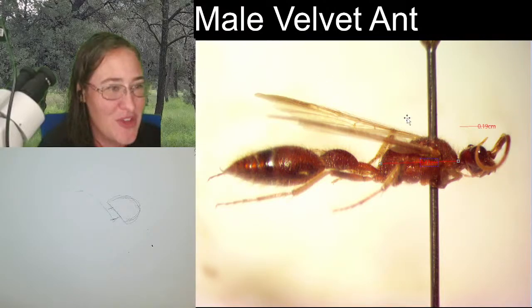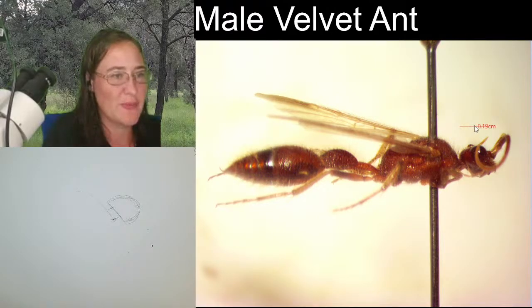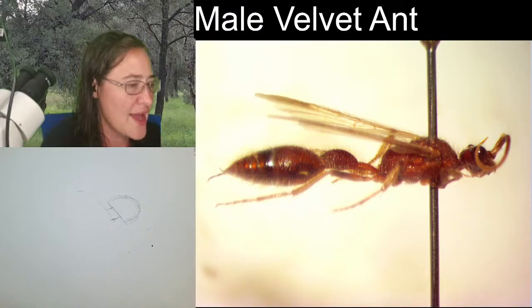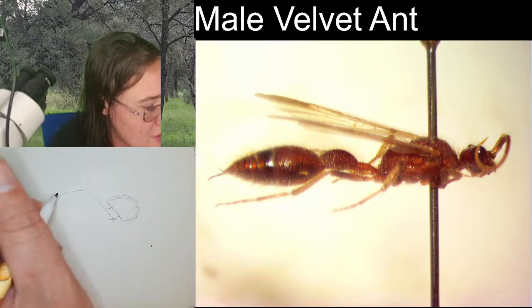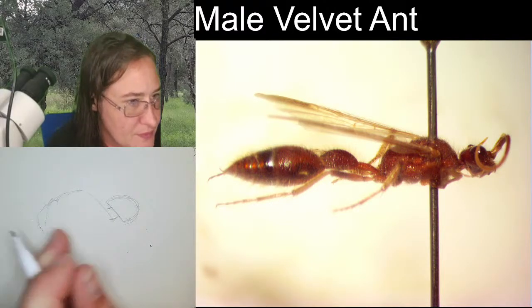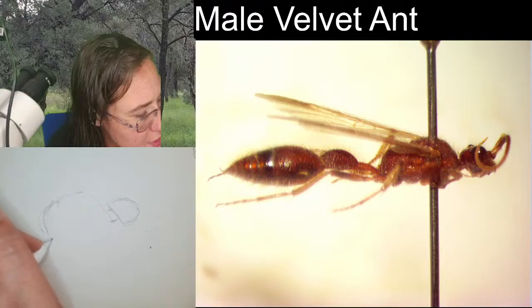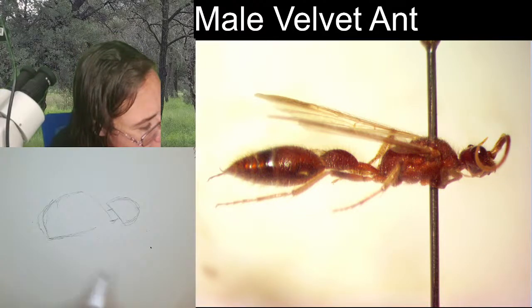And because we fit the whole thing under the microscope, we can do things like this. It looks like, if we round up just a little bit, the mesosoma is about double the length of the head. My measurement on the head was 0.19 centimeters, and the mesosoma was about 0.42. So, just a little bit longer than double the length of the head. So if I take the head here, I go 1, 2, I got the end of it, and it's going to come right around here. Shorter. Okay, so that's going to give us just an estimation of the thorax.